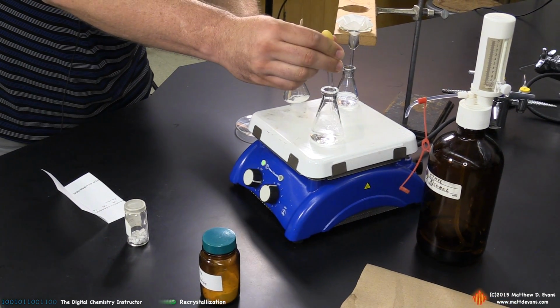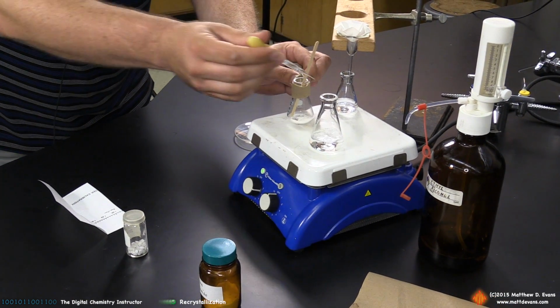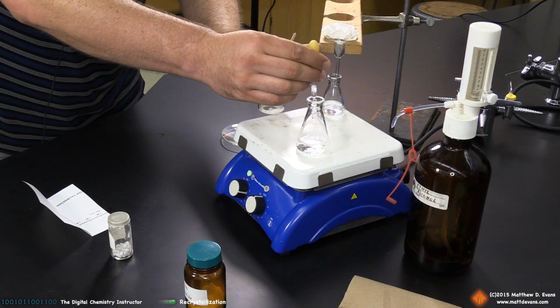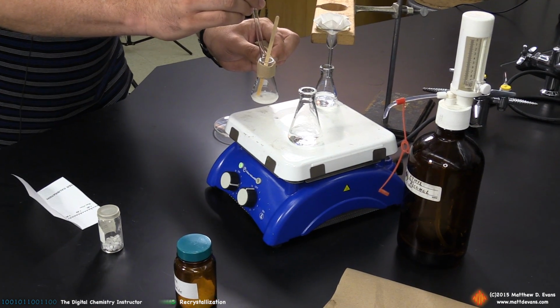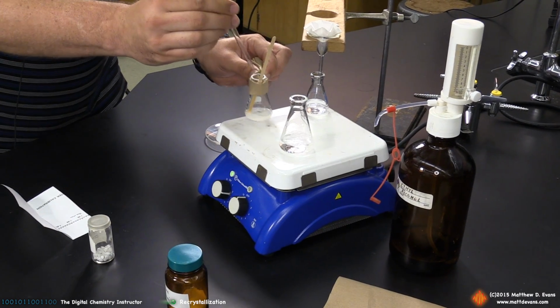So here we go. So I'm just going to add enough hot solvent to just cover the crystals. Careful not to spill onto the hot plate too. You might get a fire if you end up spilling that ethanol on the hot plate. That's bad. Okay, that's enough to get me started.